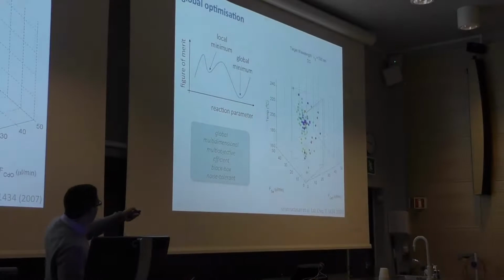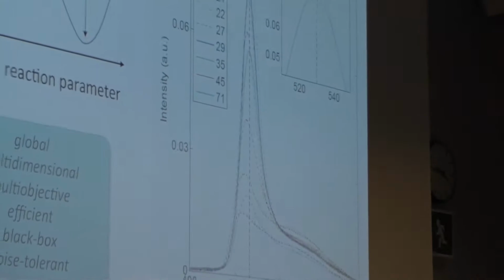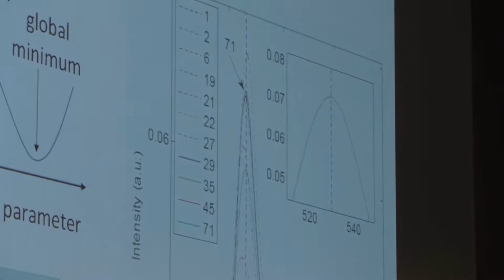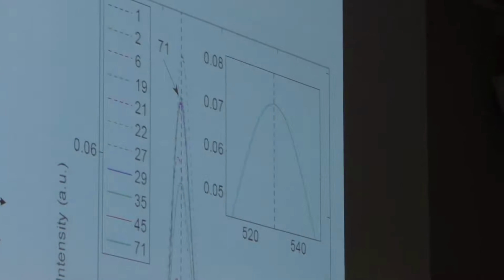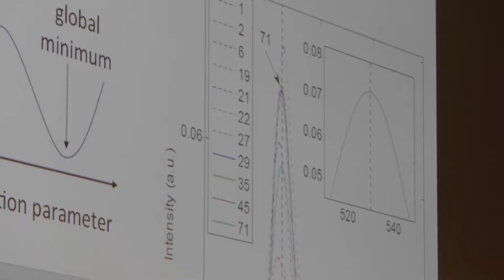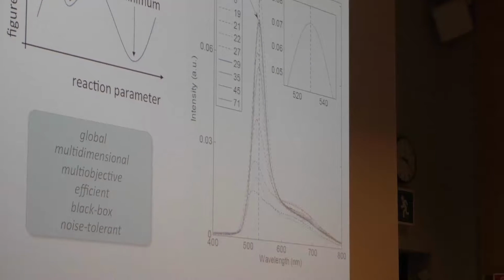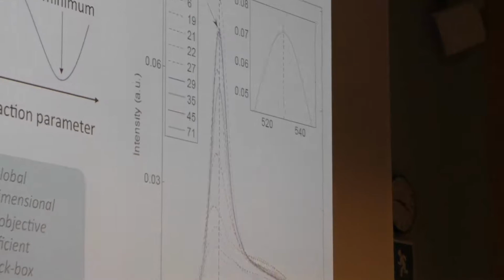So if we look at the spectra that correspond to the best points so far. We've done a certain number of measurements, and within that set of measurements, one point corresponds to the lowest fitness value. What we've done is plot that lowest value here all the way through our search, and you can see obviously when we start, the lowest value is the first data point we measure. It so happens that the second one was an improvement on the first point. We then didn't get an improvement until the 6th point, and then until the 19th point.